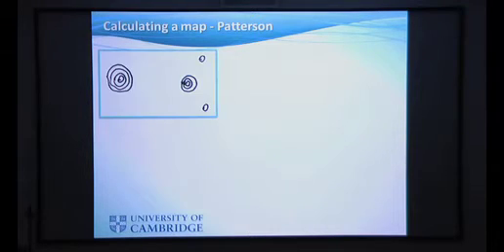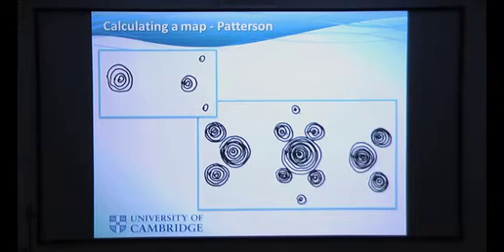So if we assume, without a crystal lattice, an electron density that would look like this, possibly being of 4 atoms, the Patterson map of this would look like this. Can you see anything that brings you from this picture to that picture?